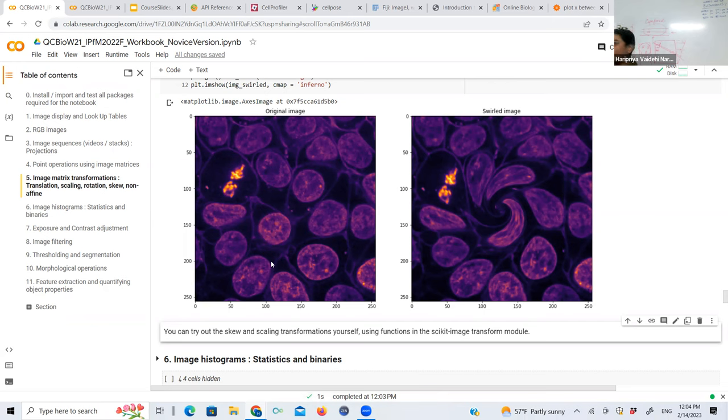To do that, we have to understand the distribution of pixel intensities. So we're going to start with the distribution and what it looks like. Build some intuition on how you cut the distribution to get, for example, only nuclei or only dividing nuclei. We're going to do a few manual examples to intuit the concept and then run into some algorithms that will automate segmentation of cells. This is the absolute core of any image analysis pipeline. That's going to be the bread and butter for tomorrow.